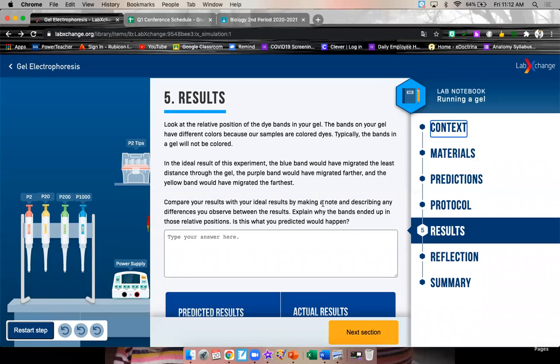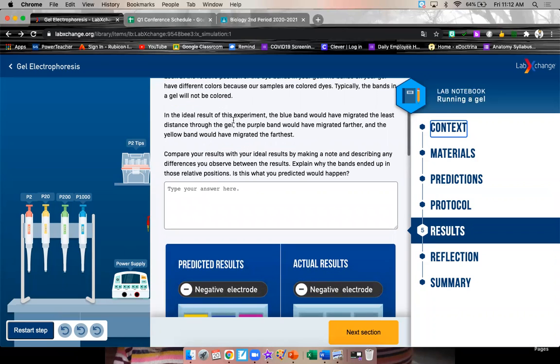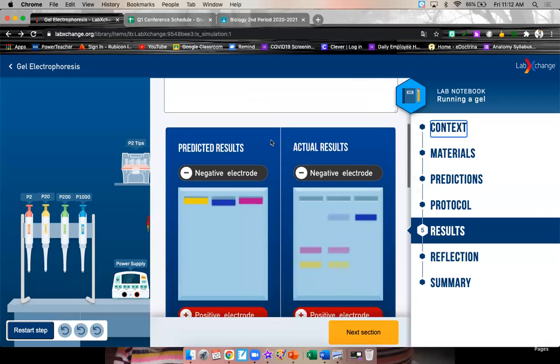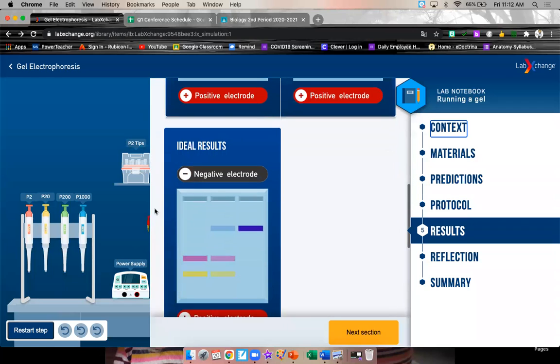So, to actually inspect it, we go to the next section and it says results. Look at the relative position of the dye bands in your gel. The bands in your gel have different colors because our samples are colored dyes. Typically, the bands in gel will not be colored. In the ideal result in this experiment, the blue band would have migrated the least distance through the gel. The purple would have migrated further, and the yellow would have migrated the farthest. We're talking about this one down here.